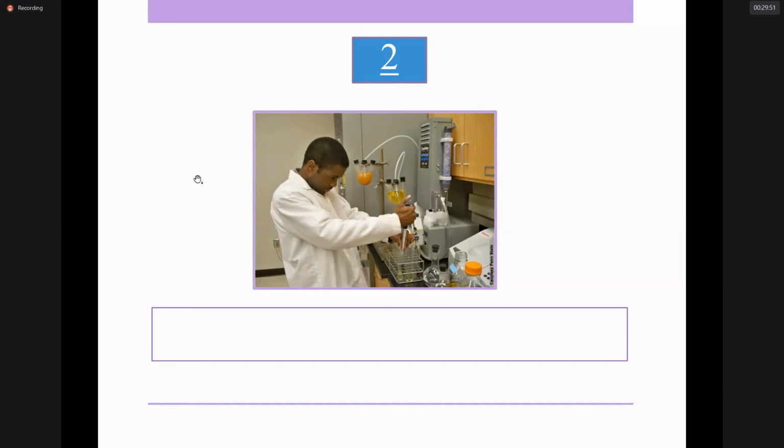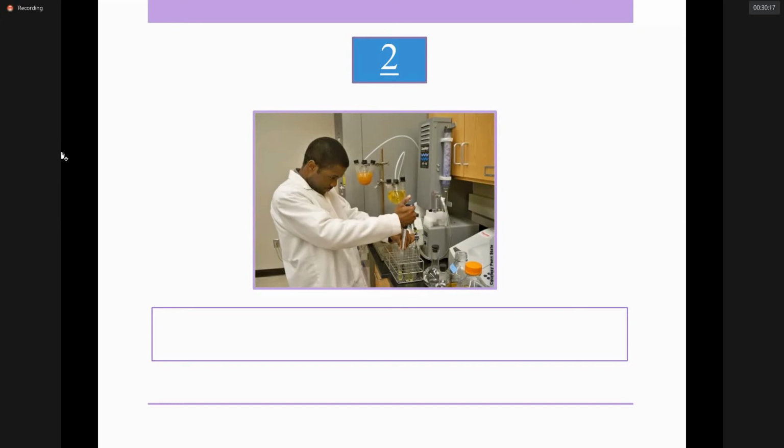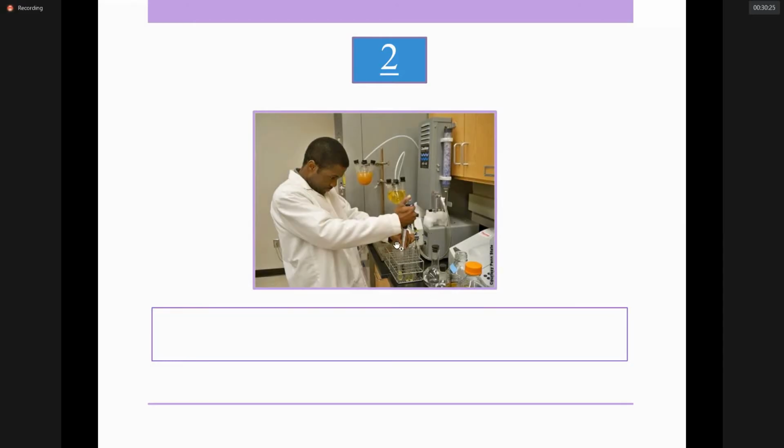ممتاز. Also, you can check the bench, the environment that this chemist is in. إنه ما مرتب. Yes, and we discussed that in the previous lecture. لازم يكون uncluttered, organized, سواء كان في الفيوم هات أو بالبنش. لاحظوا it's a lot of equipment and flasks والtubes. ممتاز.